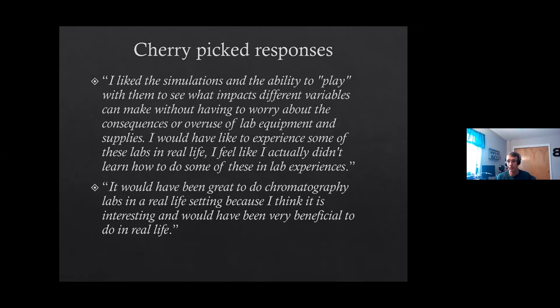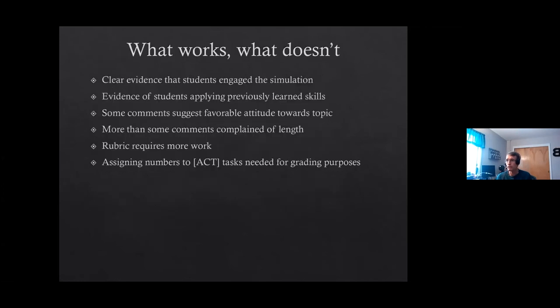And oftentimes what happens is the students are really just making a sample, putting it into an auto sampler, pressing a method button, and then walking away. So that's not really using an instrument. Coupling it with the simulation might help address some of that.